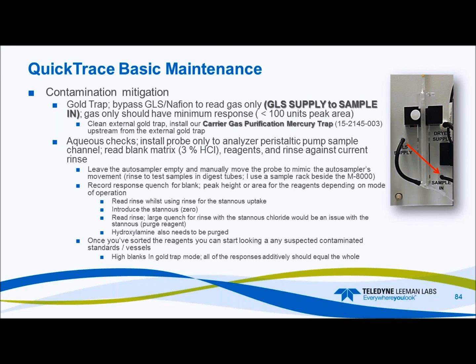With using the purification trap, that eliminates the mercury that's in the argon, and there's a lot of mercury in the argon. 4,900 tons approximately every year up in the atmosphere. Where do they get the argon? They distill the atmospheric air and make your trace gases, your argon, your nitrogen, helium, and so forth. So all that mercury in the air goes into the argon. So yes, we need to keep it pure.